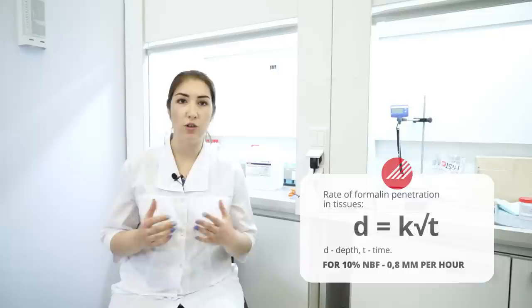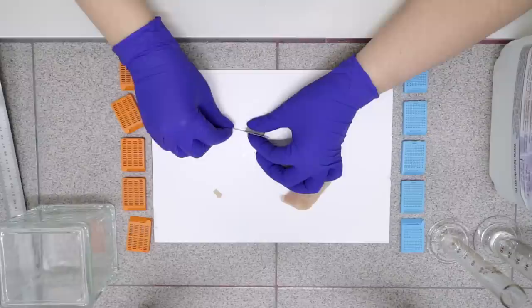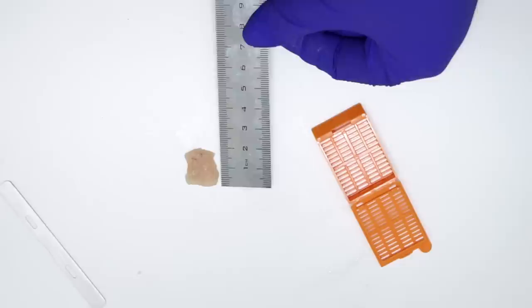The thickness of the samples after grossing should be about 3 or 4 mm. It will provide good penetration of formalin in the tissue and all parts of the material will be fixed.